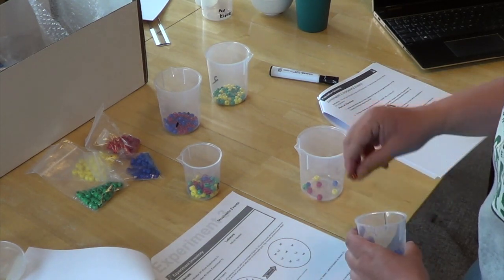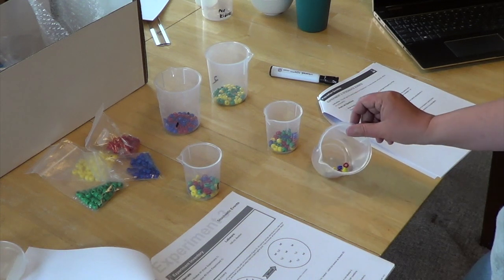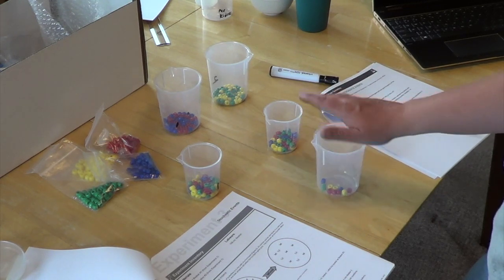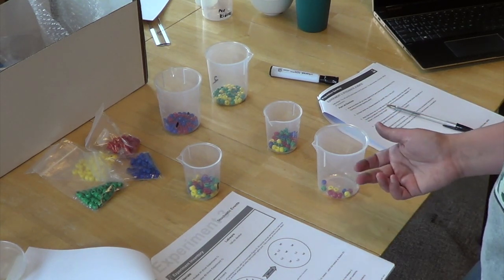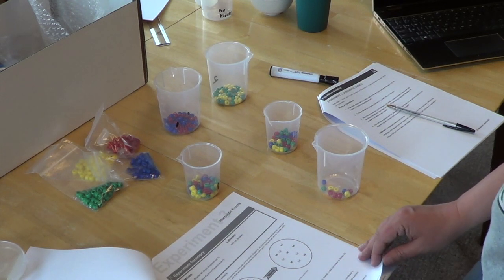Try not to look when you're doing it because you want it to just be random chance. Okay, and so you might have differences in what you had from beaker 2 than what you had from beaker 1. And so you're just noting that and how chance can affect a population, or destructive events can affect a population.